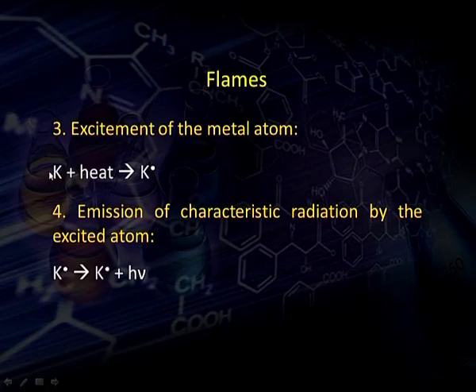Next is the excitation of the metal atom. Now, the K, the metal atom, on heating transforms to K free radical. Then comes emission of characteristic radiation by the excited atom. Here the K free radical emits a particular radiation, h nu.